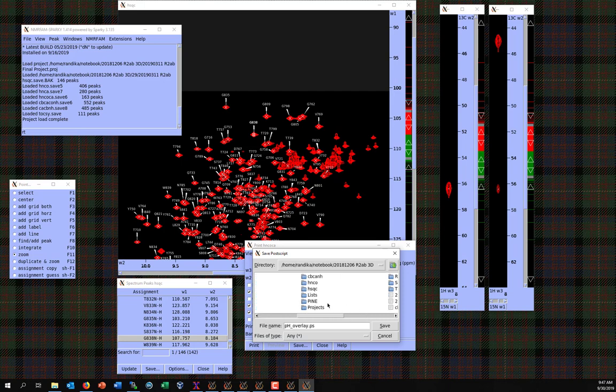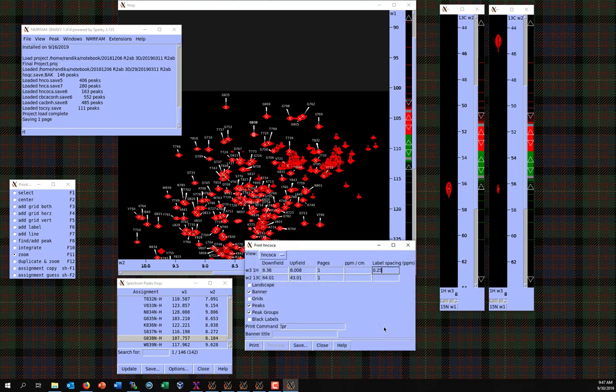So we'll save it under lists, which I think is where. And since this is G838, we'll just call it 838HNCOCA.PS. You can save it whatever you want, but it's best to do something that you're going to remember, because we're going to be generating a lot of these. Now we can just select HNCA.